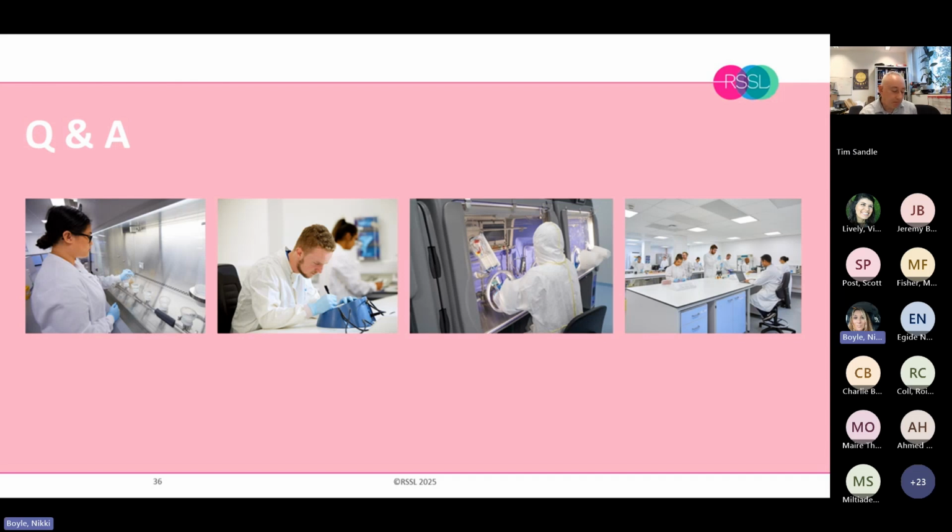That's really helpful. Another one, I think MHRA are quite hot at the moment. Will regulators accept suspension tests?